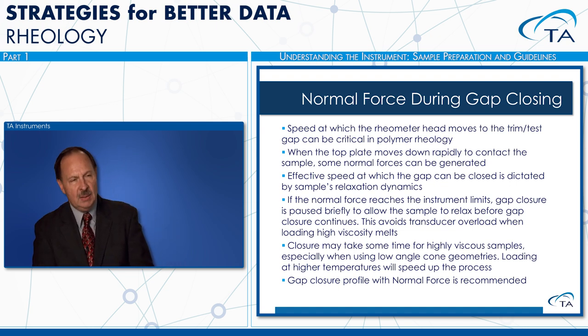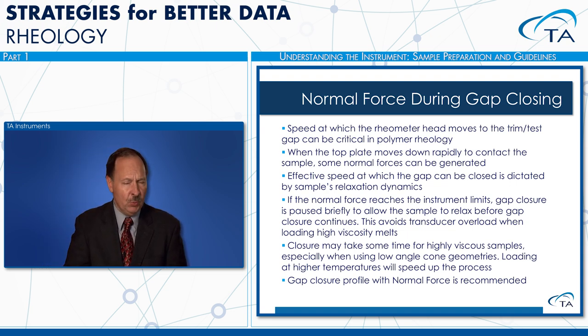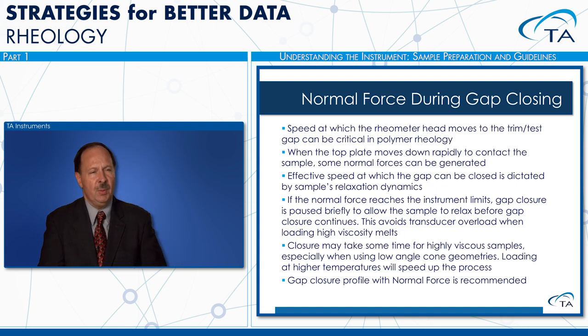But a lot of times when we do this gap closing, we don't want to exceed the limits of our instrument. And as we mentioned in this statement here, this may take forever if you're using the cone and plate geometry. So if you use the cone and plate geometry, sometimes it's good to change to the parallel plate geometry. This definitely gives you more freedom, and it's a lot easier to load your sample into the rheometer.